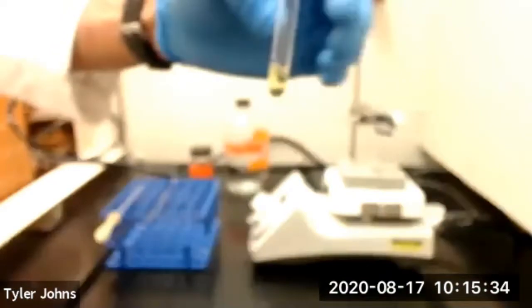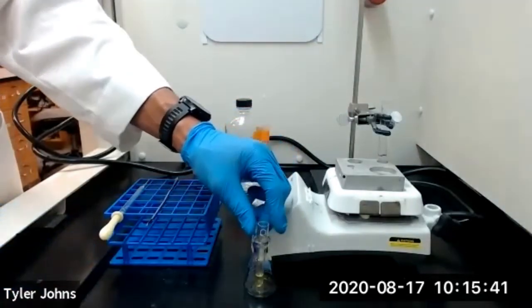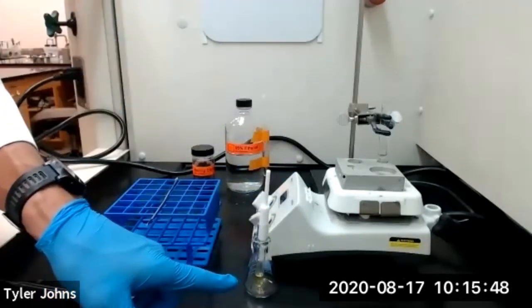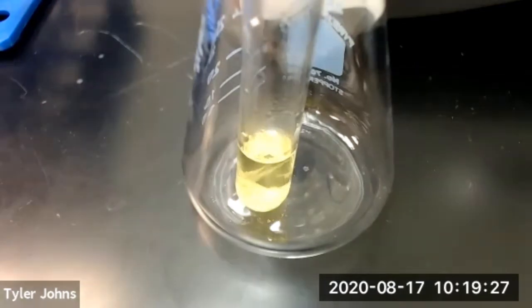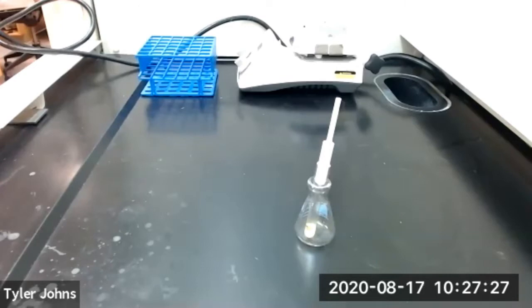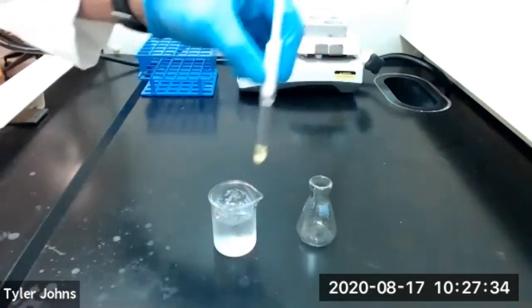remove your Craig tube from the heat and insert it into a 25-milliliter Erlenmeyer flask. Insert the plunger into the Craig tube and allow the solution to cool to room temperature slowly. Once it appears that crystallization is no longer occurring at room temperature, transfer the Craig tube to an ice water bath to complete crystallization.